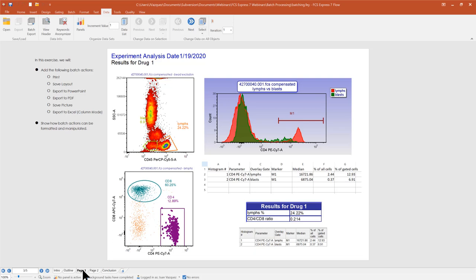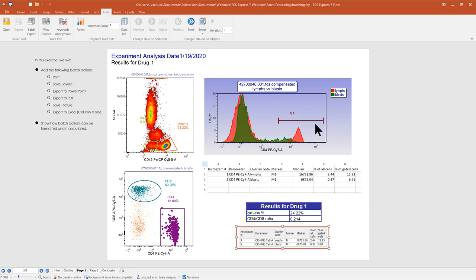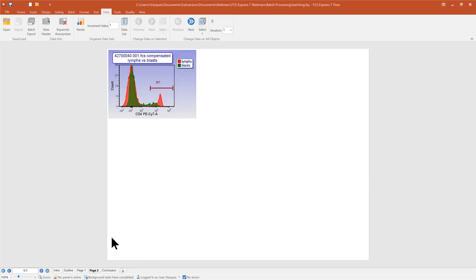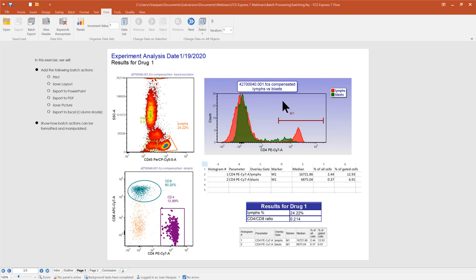This template is a simple one. I have three plots: one histogram with multiple overlays, a density plot, and a dot plot. Some gated events have colors applied, and I'm also emphasizing various events. I have a spreadsheet with data, a customized table with statistical information, and a statistical table relating to my histogram. I also have a second page with another copy of that overlay plot, which I'll explain shortly.